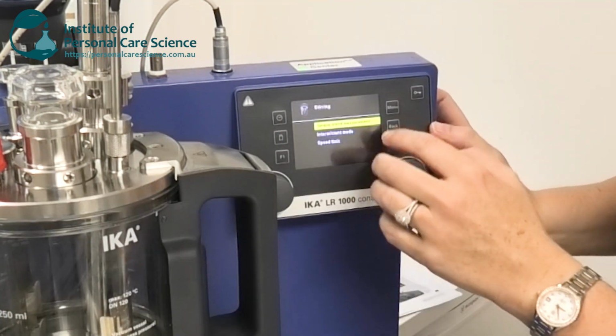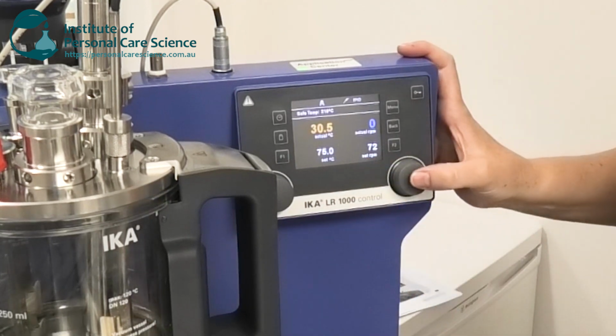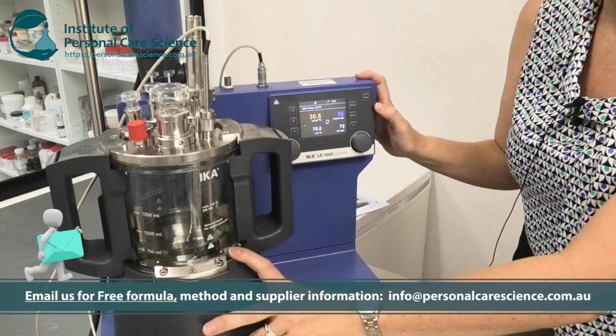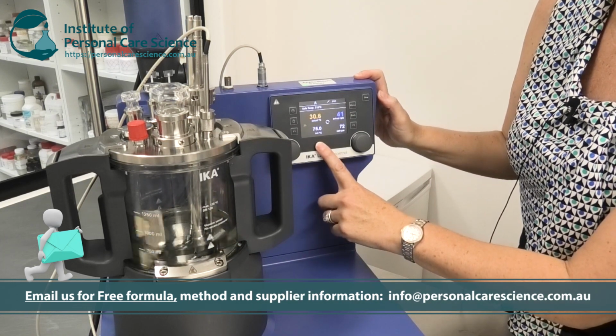So I don't even need to be standing here to make this machine work. Now to our formula. First of all, I'm going to start the stirring, and I have set it at the moment to 72 RPM. I'm also going to start my heating. So this is my water and glycerin in here, my phase A. I'm going to heat this up to 75 degrees.